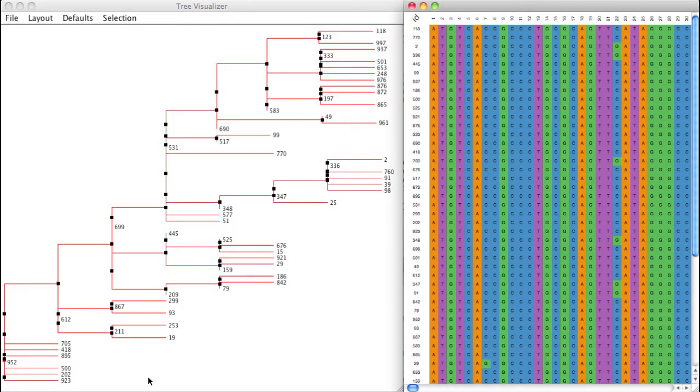After performing a phylogenetic analysis of the nucleotide sequences restricted to the sequences of the current disease outbreak, we imported the resulting tree in the tree visualizer. In the matrix viewer, we can sort the IDs and select them individually. The corresponding nodes are simultaneously selected and highlighted in the tree. We selected the three IDs with label 583, 123 and 51.